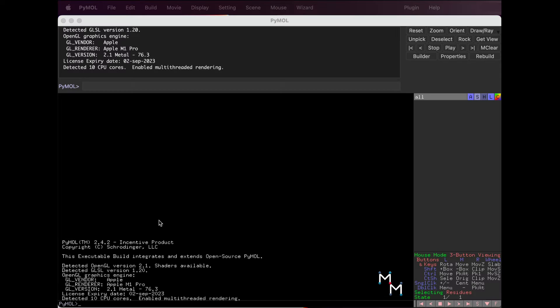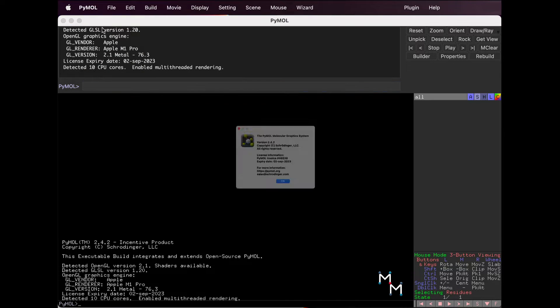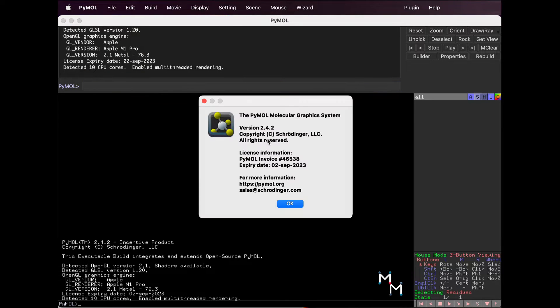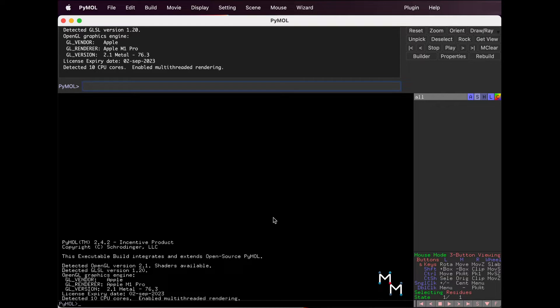Let's begin with basic operation of the Pymol 2 Graphical User Interface, or GUI. I'm using Pymol 2.4.2. If you're using another version, you might notice differences. Feel free to drop your version number and observations in the comments to help out other learners.